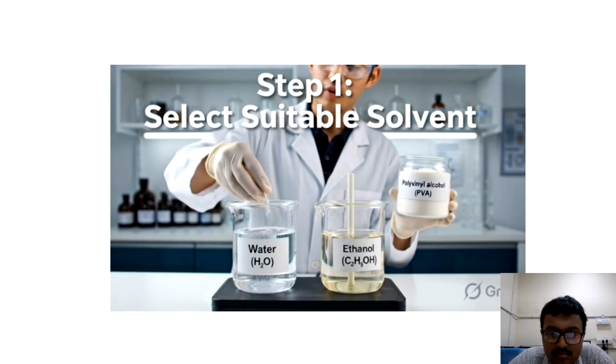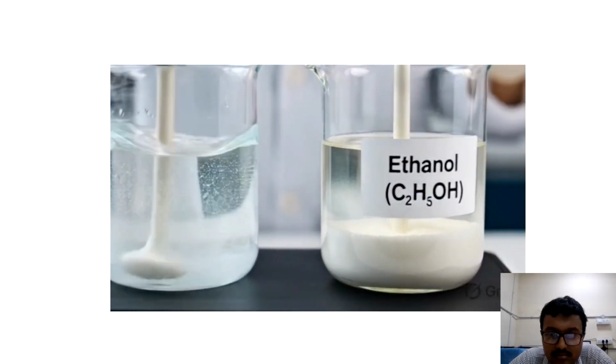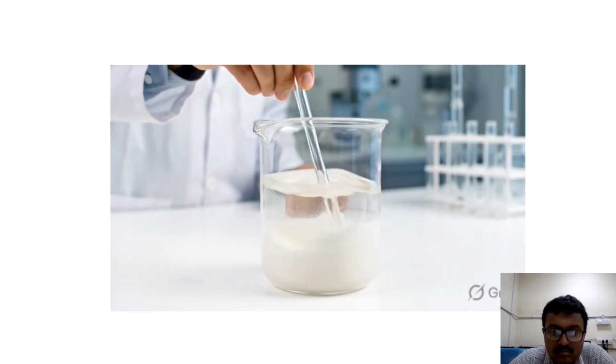First, select a solvent where your polymer is completely soluble. Here, PVA dissolves in water but not in ethanol. The water solution is clear, ensuring an accurate viscosity measurement. Prepare a dilute polymer solution using the solvent. Dilute solutions are important because the density of the solution is approximately equal to the density of the solvent.